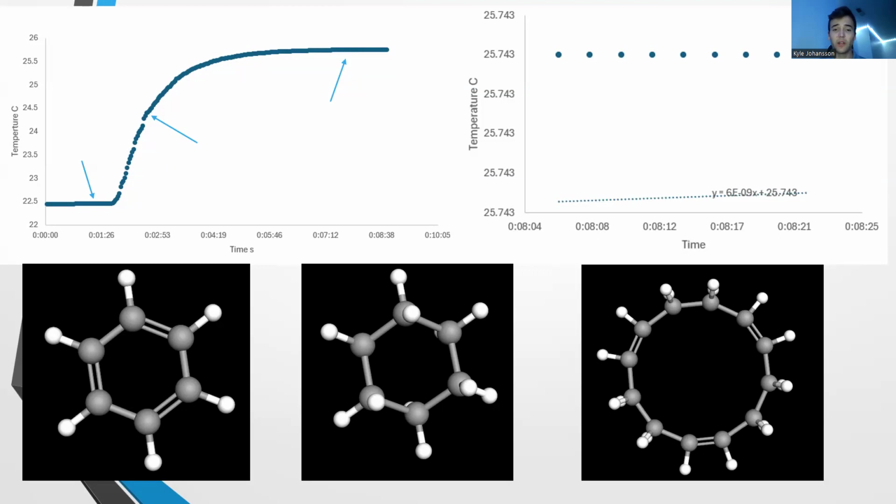After doing some initial analysis on the graphs, the next step is to do the calculation to determine the change in temperature. As previously stated, the points of interest from the graph were used in this equation for both their time and temperature values. On the right side of the equation, we can see the R variables, and those are the slopes of the more focused graphs that were previously mentioned.